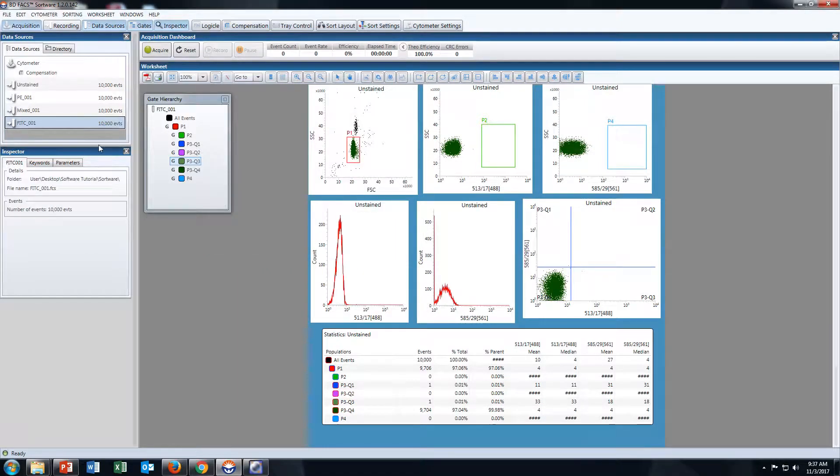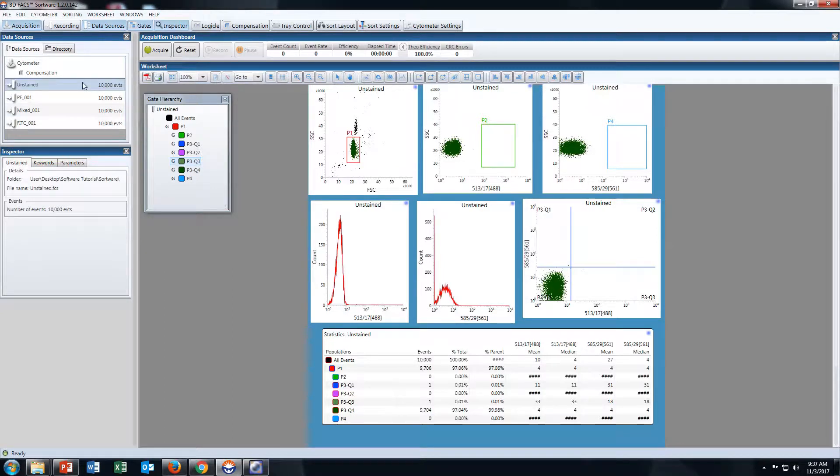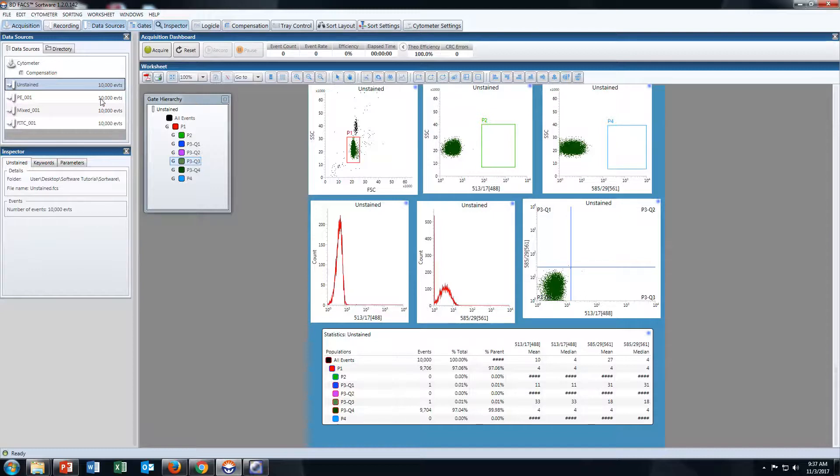Now we have exported all FCS files from Influx data to DIVA-compatible format for BD FACS DIVA software.